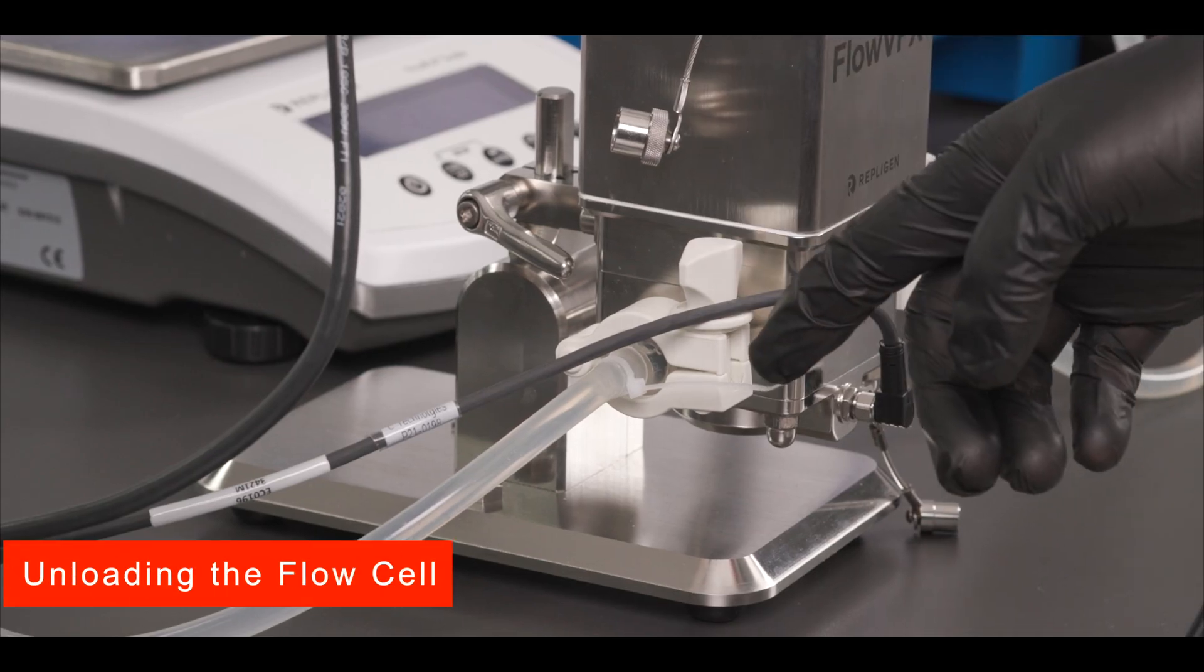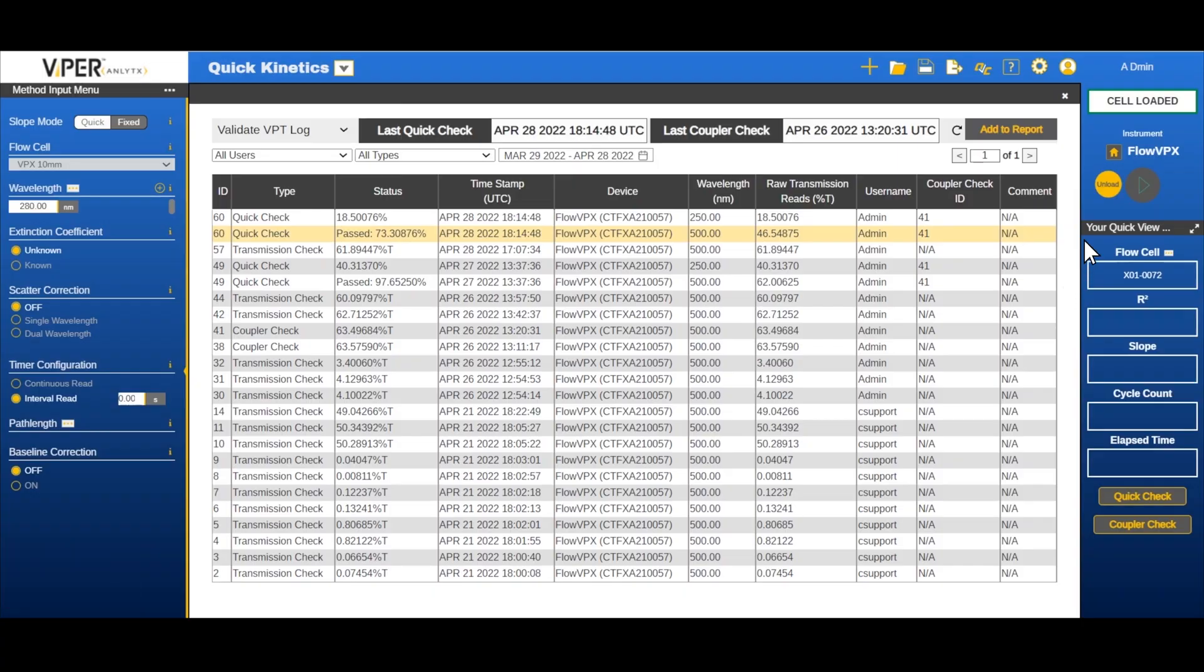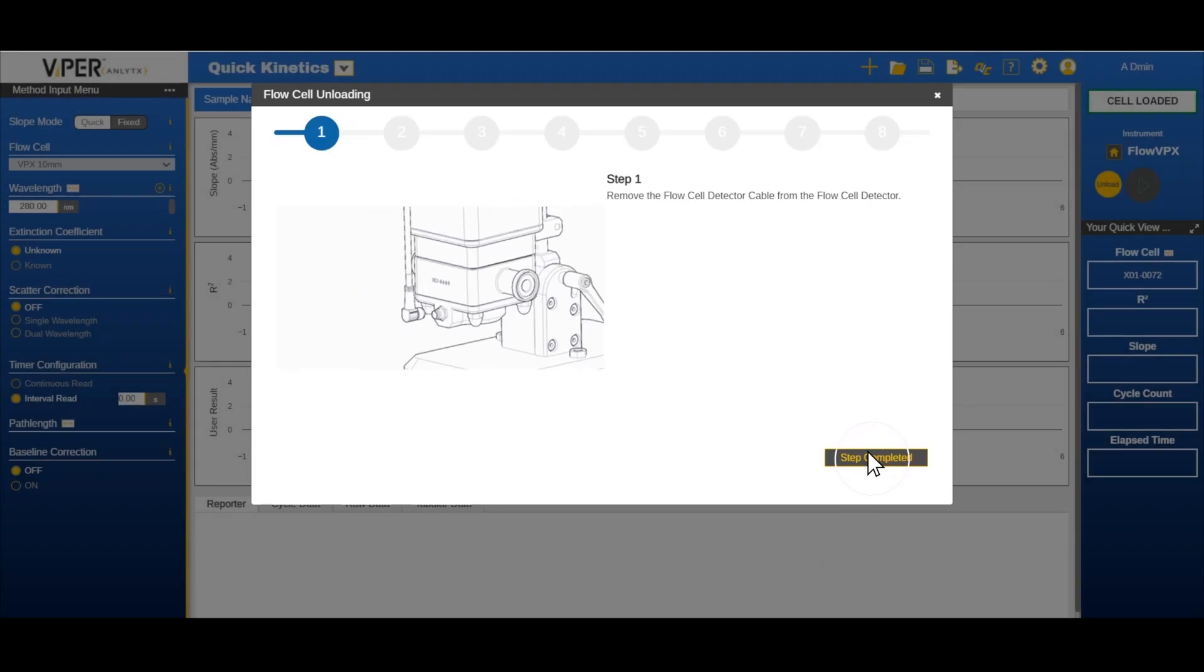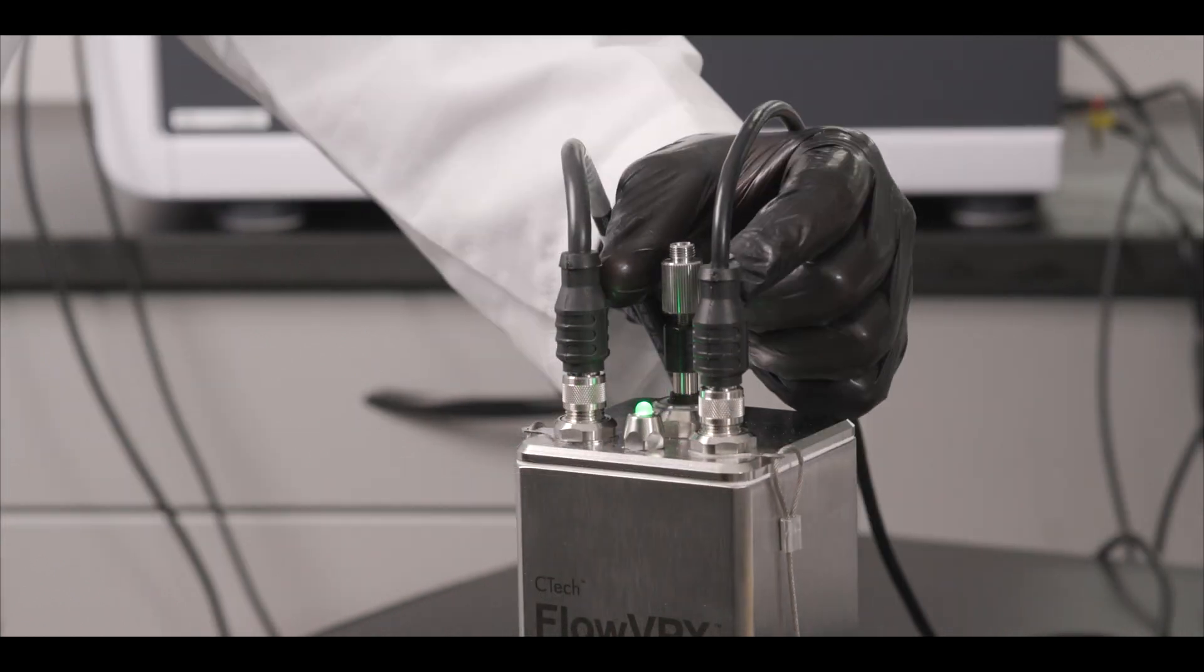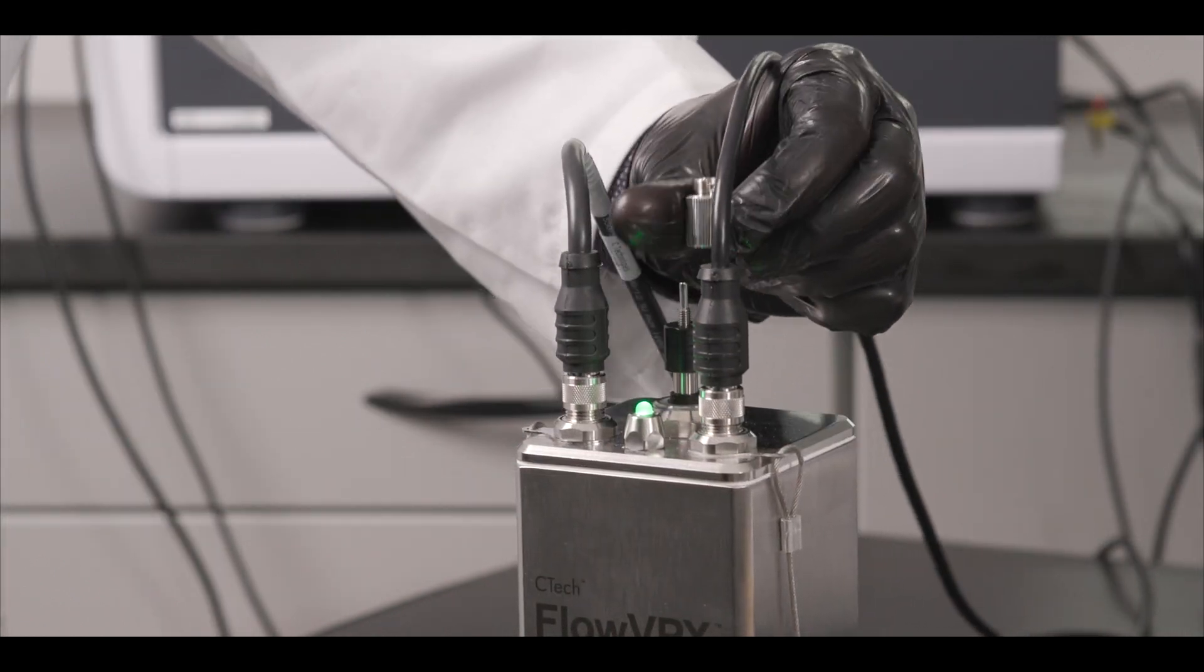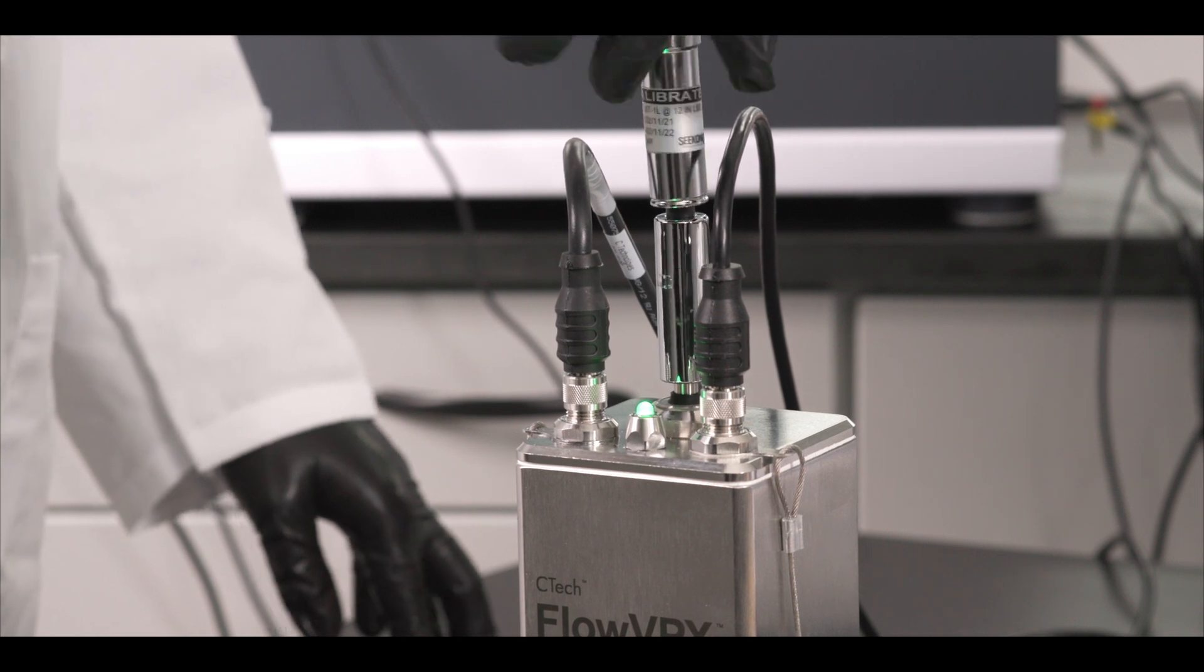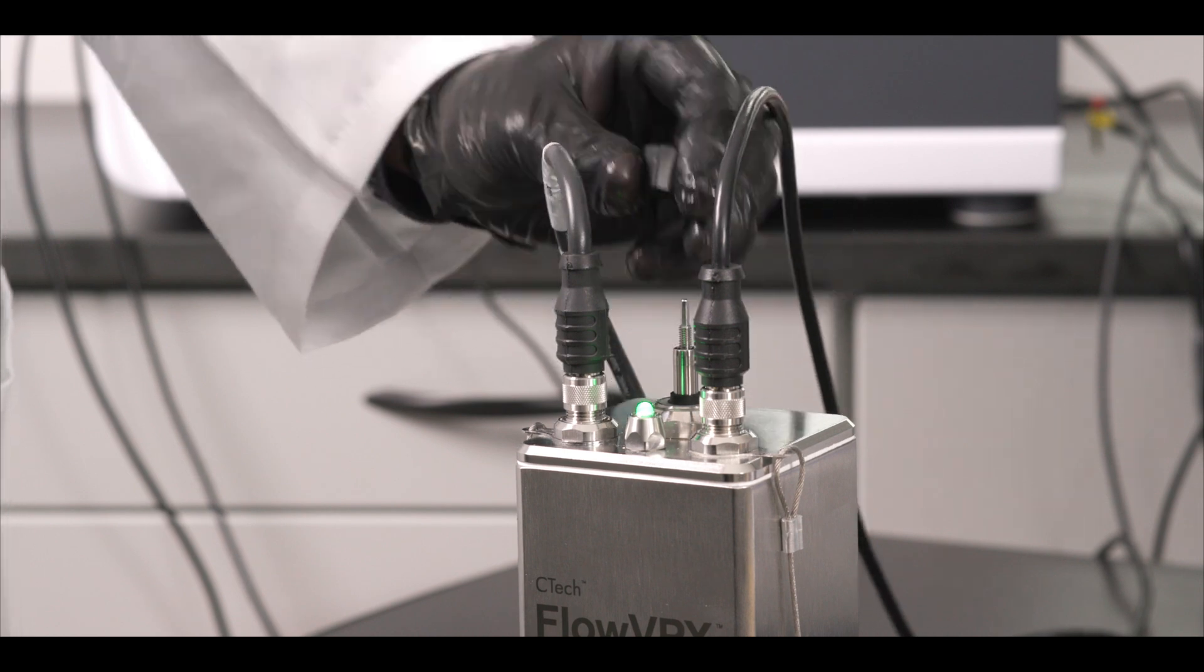To unload the flow cell, first ensure that there is no sample flowing through the flow cell. Click the unload button on the instrument control. Follow the steps prompted on the screen, then click step completed to proceed. First remove the detector cable, then the delivery fiber and the FC and FX connector nut from the FlowVPX instrument. Carefully set aside.